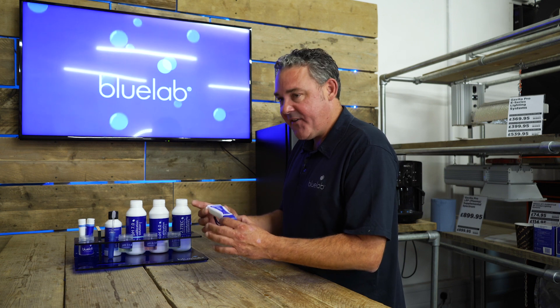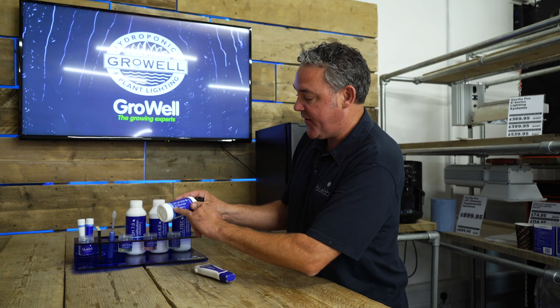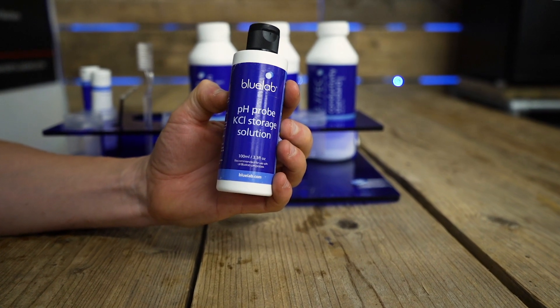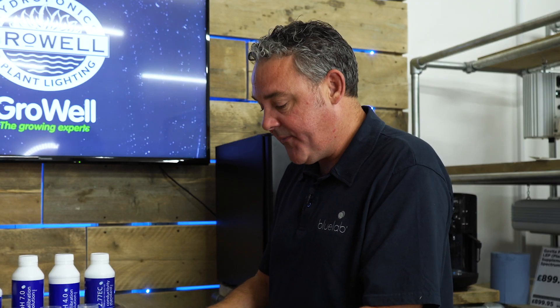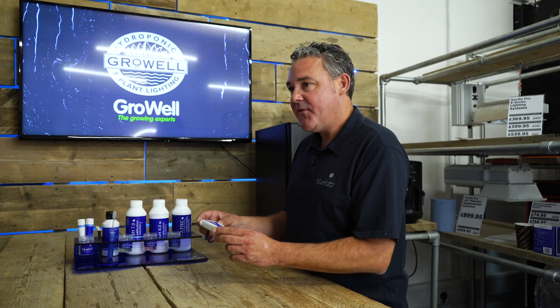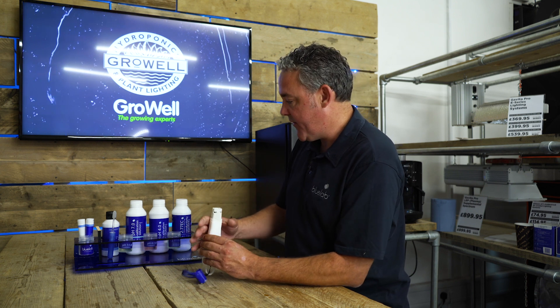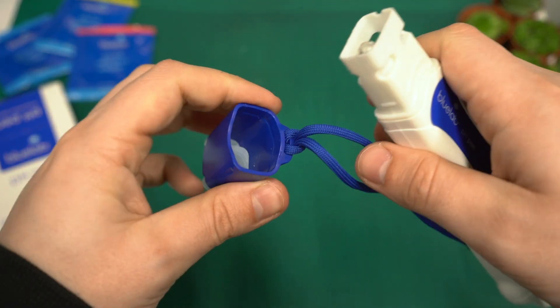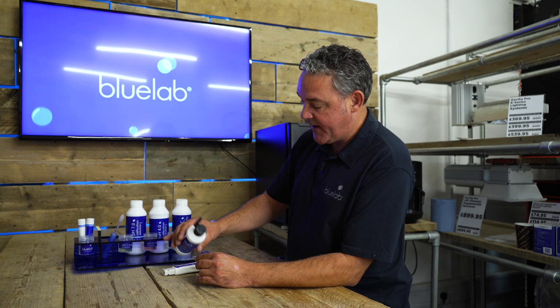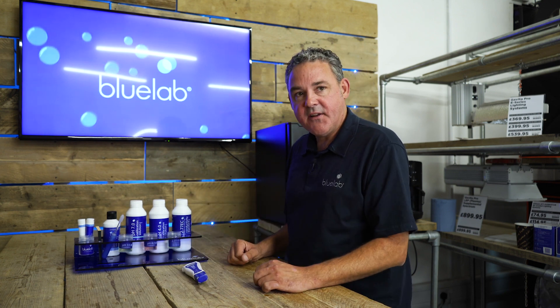The most important thing with your pH pen is to clean it, calibrate it, and make sure it's correctly hydrated in KCL. KCL is potassium chloride — this is Bluelab KCL but there are plenty of other brands, it's all the same stuff. Inside the probe is a KCL solution; it's what the pen needs to work correctly. The two most important things about maintaining a pH probe are cleaning and hydration. Inside the cap is a little sponge — it's very important that you regularly hydrate it with KCL. Just put a few drops in that sponge every time you use it, put the cap back on, and it's good to go.